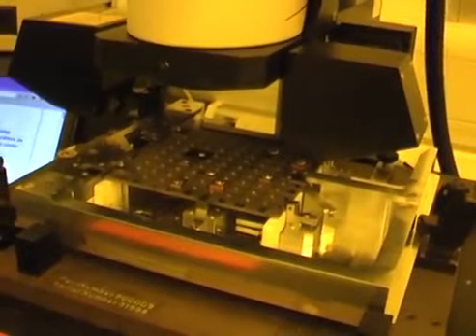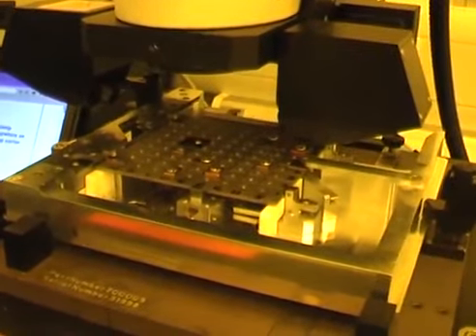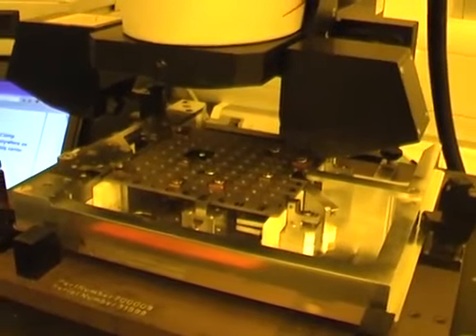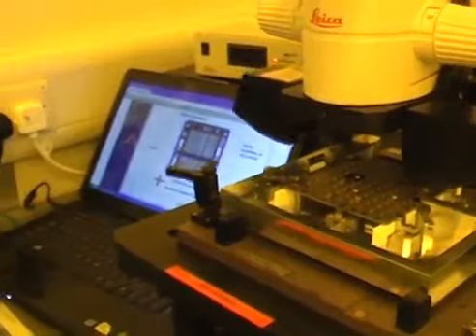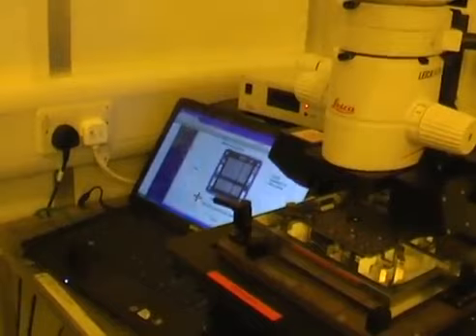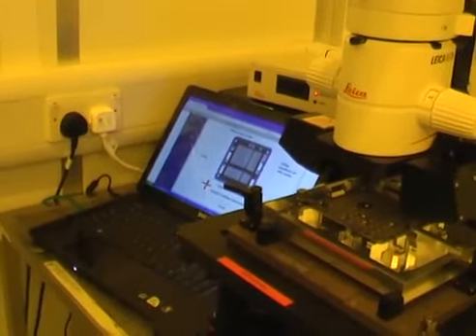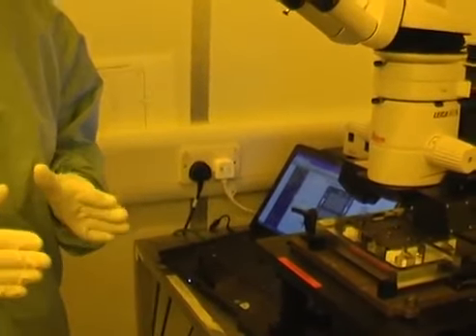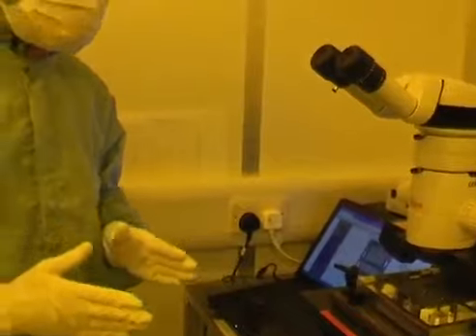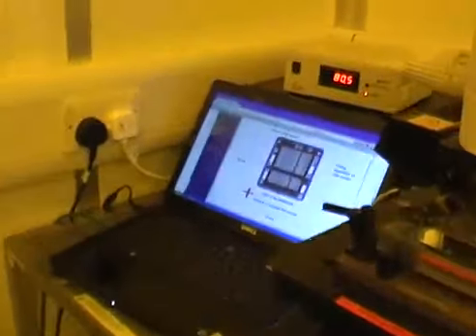Ideally, it should be within plus or minus 50 microns. So what we're saying is this sample is too high, so I need to adjust the height. And that means adjusting these height references in the corners. But before I do that, I want to check not just that it's okay, I want to check that it's simply a matter of height and not a matter of tilt. And I can do that by starting that there.